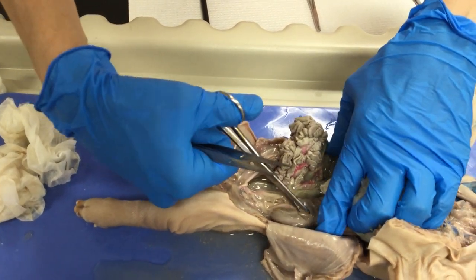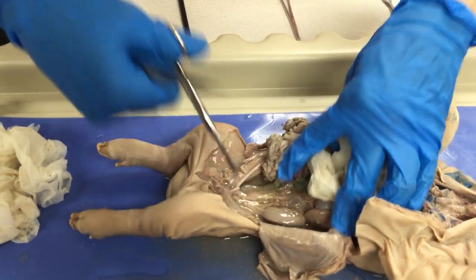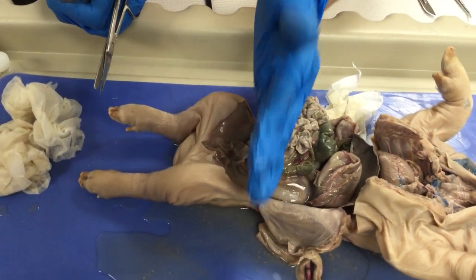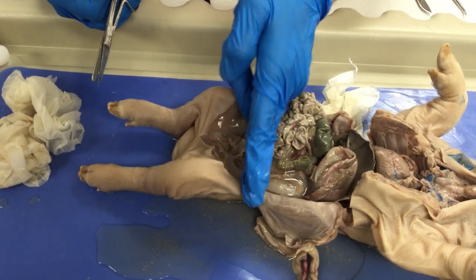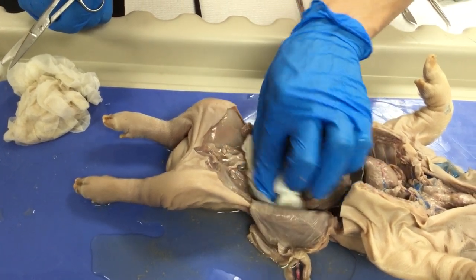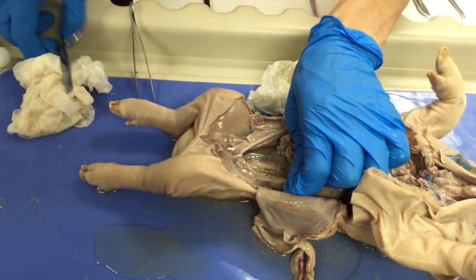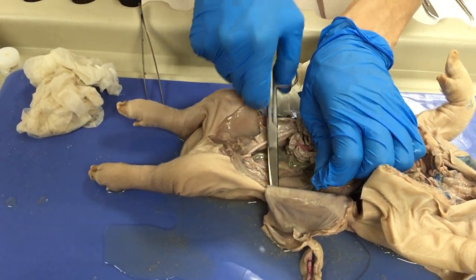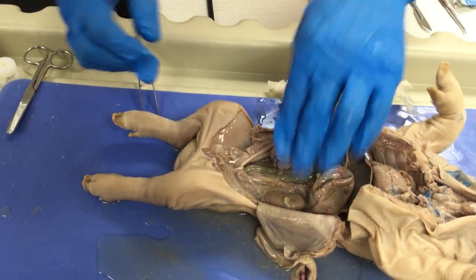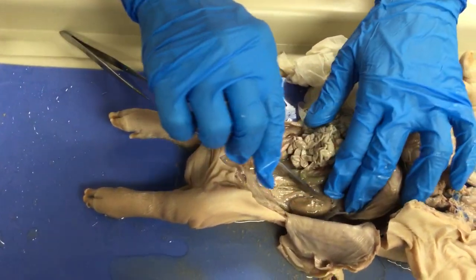Another way to refer to the abdominal cavity in general would be the abdominopelvic cavity. The pelvic cavity starts from the anterior superior iliac spine and below. Within the pelvic cavity we have organs like the urinary bladder, parts of the reproductive system — in males the vas deferens, seminal vesicles, etc., and in females the ovaries, fallopian tubes, and uterus. Here we have the kidneys — you can see one kidney there.